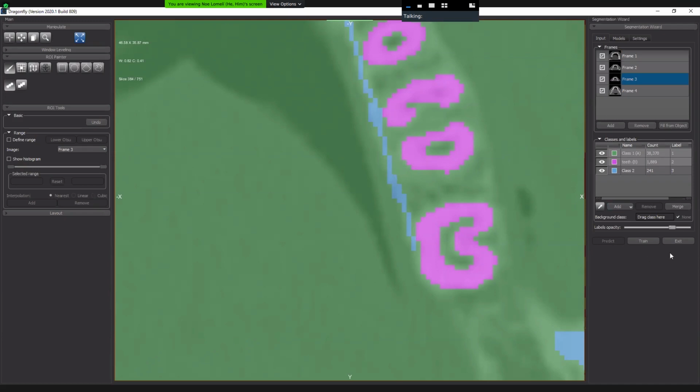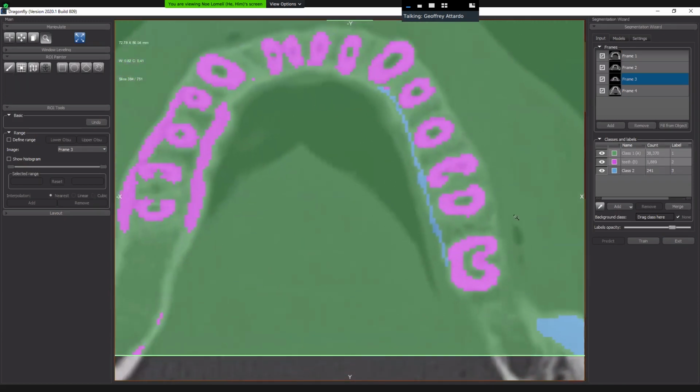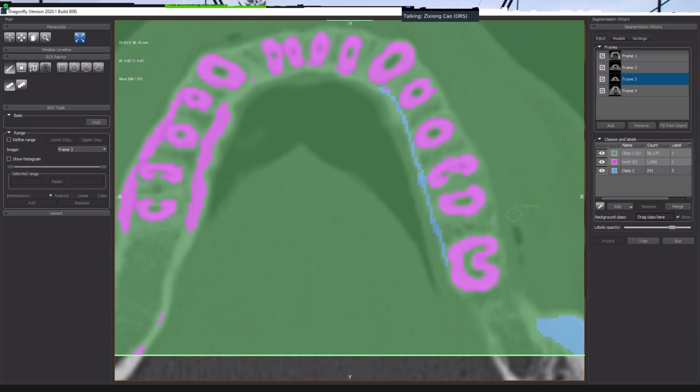How many classes can a deep learning model handle? Well, I think there's no limit for that. I saw a person do like 30 classes, but I never did that. The most I did is 5 classes. But I don't know if we have any limit for that.